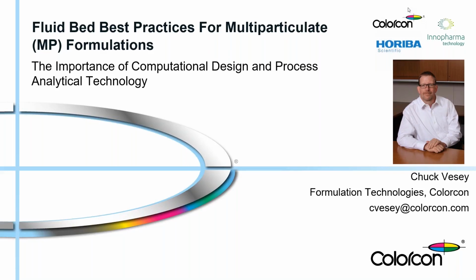So as Jeff mentioned, my name is Chuck Vesey. I'm a formulation technology manager here at ColorCon. And for this portion of the webinar, I'll share best practices for formulating multi-particulates that speed development and build quality into these dosage forms. I'll also share a case study tool, namely dynamic image analysis, that was used in a case study to demonstrate these goals.